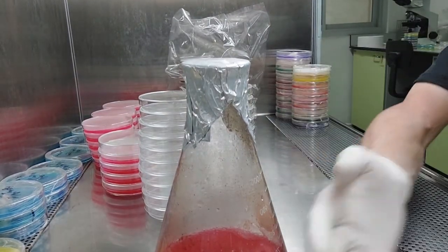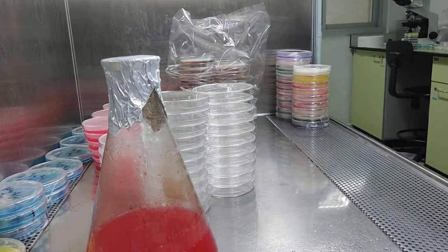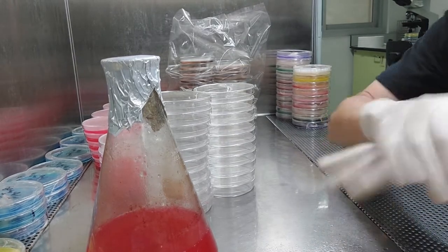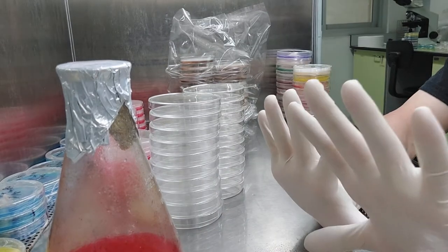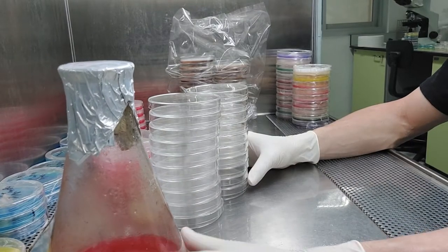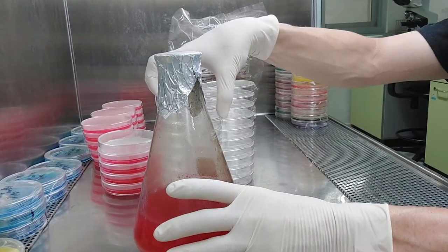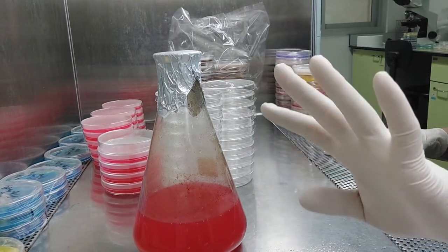I'm wearing gloves and I'm going to spray them with my 70% alcohol. I don't care what people on the internet tell you — if you are pouring plates without gloves on, you're wasting your time and wasting resources. One pair of gloves costs about 5 or 10 cents. That stack of plates, my media, and my time costs probably 10 or 15 bucks. Which one do you want to throw away? Bad idea. Just wear the gloves.